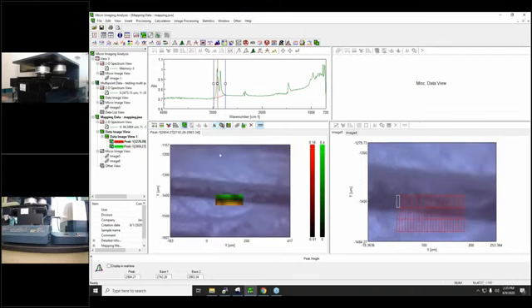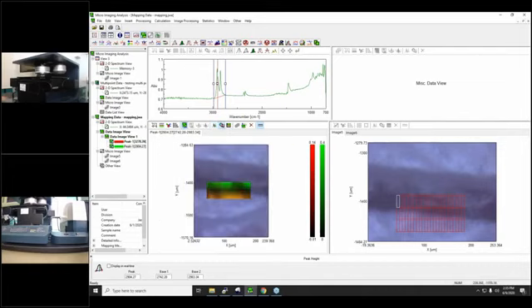So we can see here the polymers, and actually this sample is really straightforward because we can see that there is a clear interface between the two polymers, the two layers, but we can do the same with more complex samples. But the main takeaway from this image is that we can separate and identify different functional groups in a multi-layer polymeric sample.